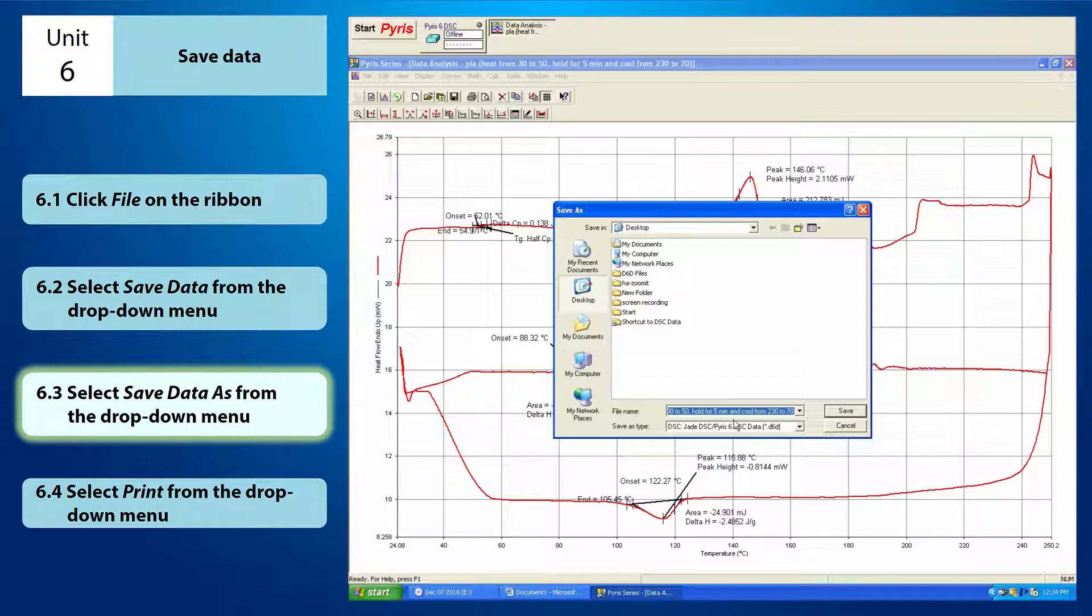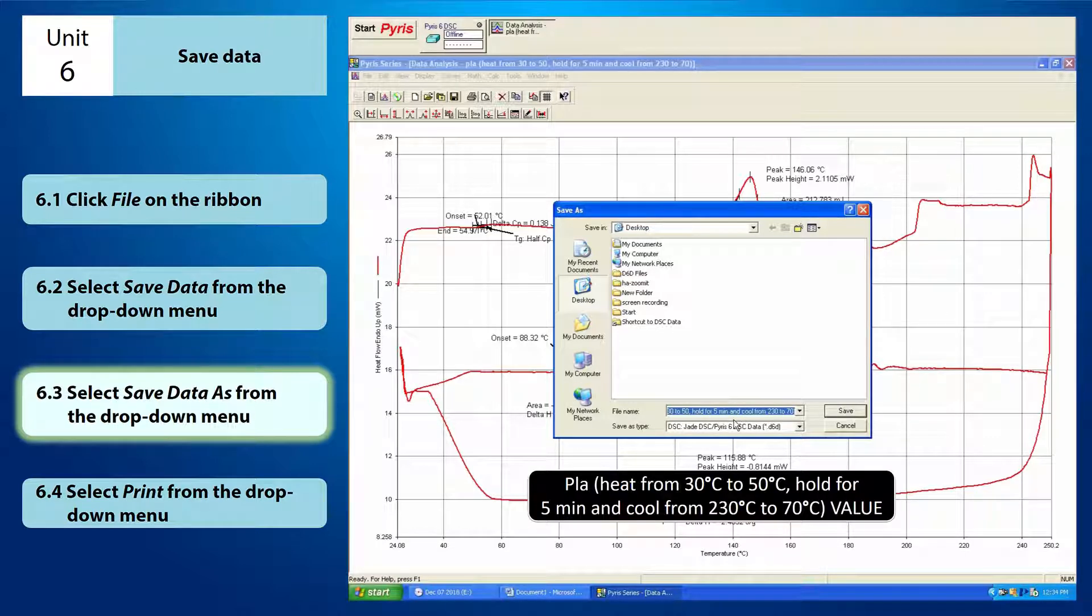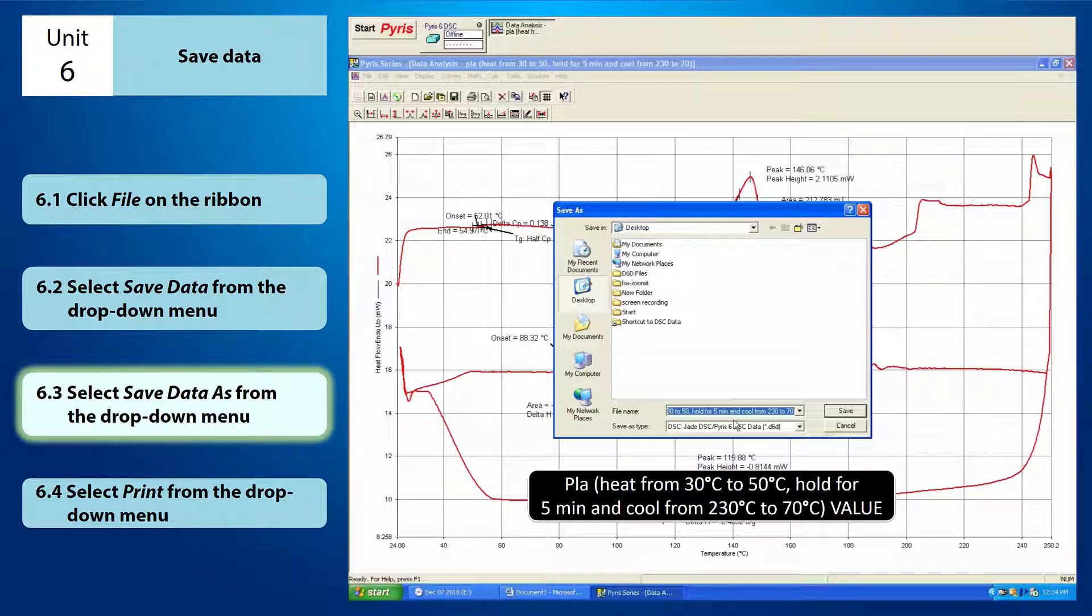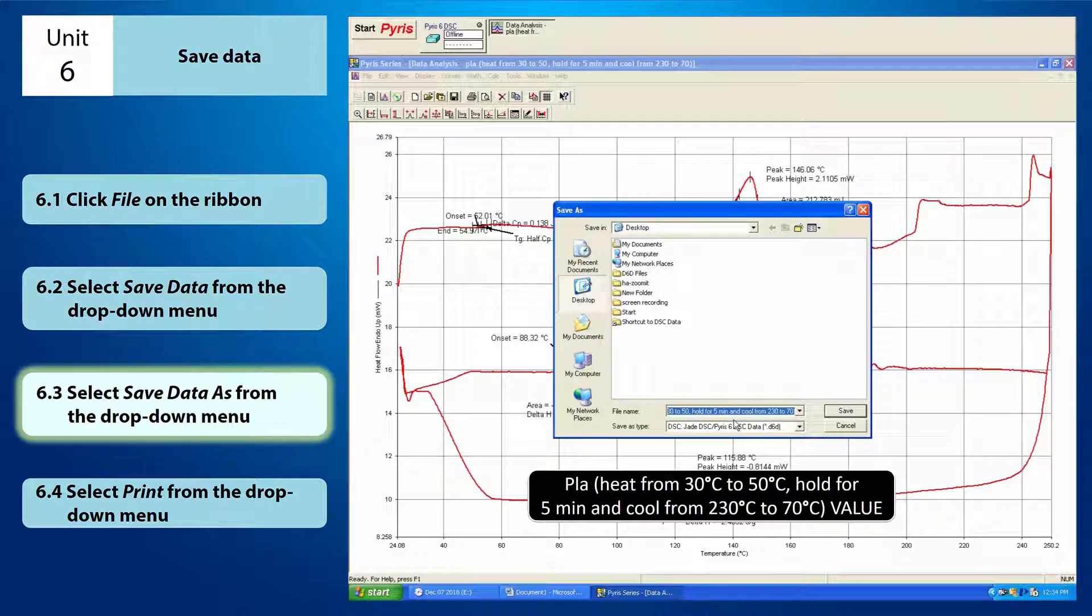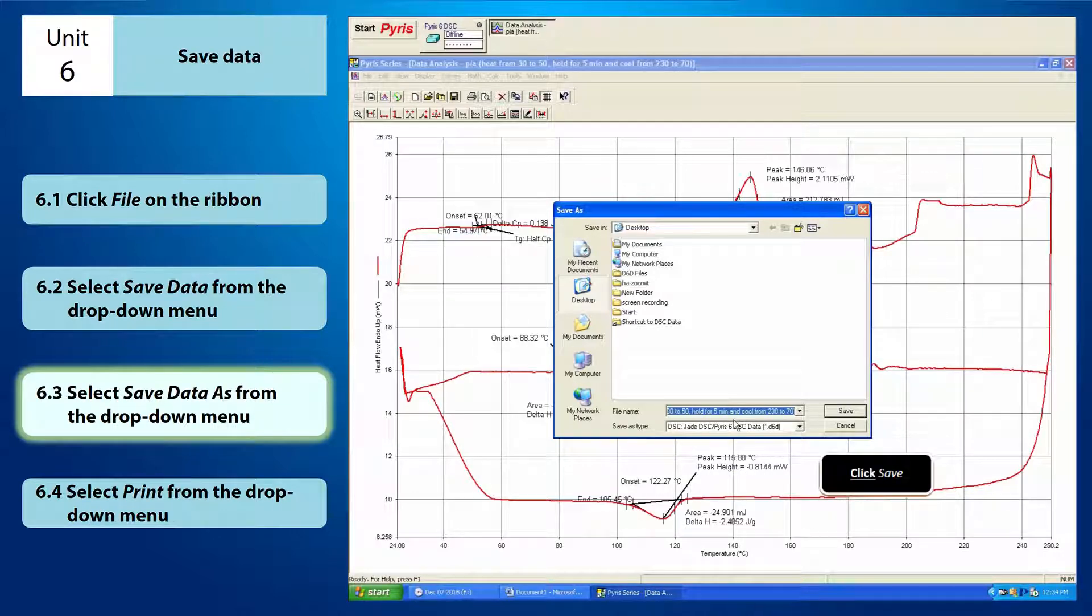For instance, I'm going to save my file on the desktop and I'm going to rename the file as PLA in bracket, heat from 30 Celsius to 50 Celsius, comma, hold for 5 minutes and cool from 230 Celsius to 70 Celsius, and click save.